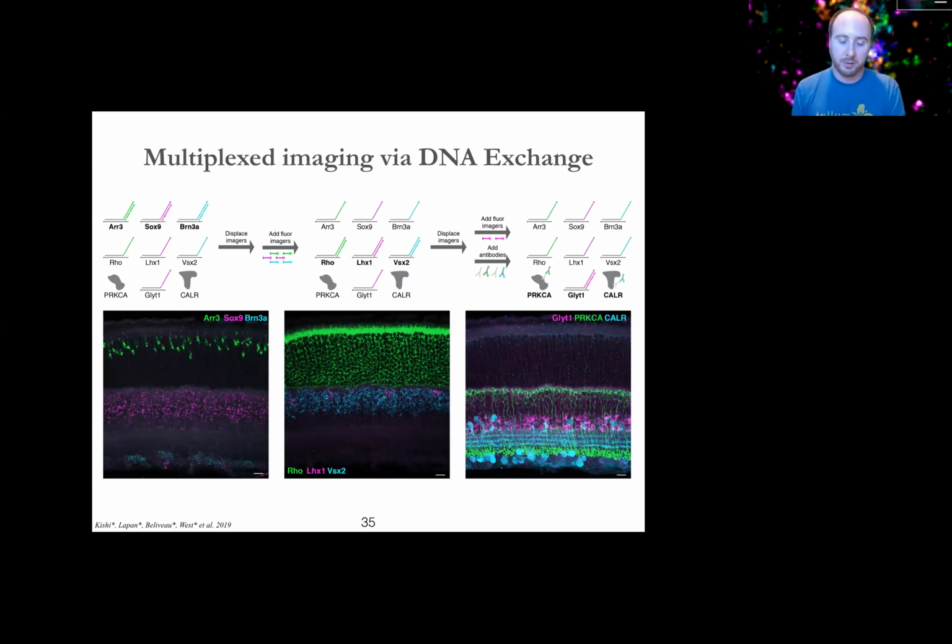So, in theory, we can do unlimited numbers of serial imaging rounds as long as we don't run out of these PER sequences to use. Right now, we have about 50 of them, and there are ways we potentially could recycle them as needed. So I think there's a lot of potential for doing many, many colors using this approach, even without using a combinatoric code to boost the number of colors you can get per round. And the reason that this works so well has to do with the kinetics of DNA hybridization.